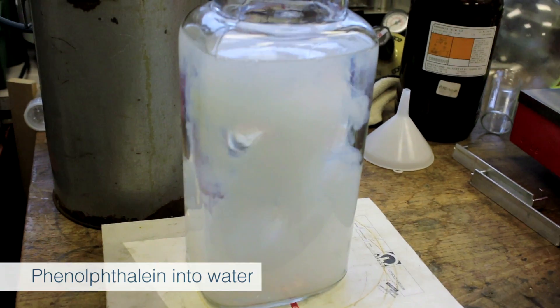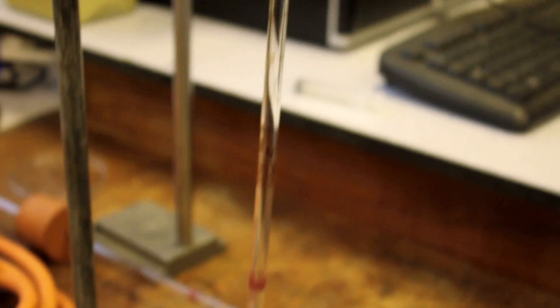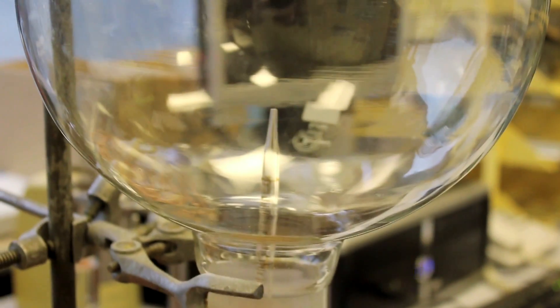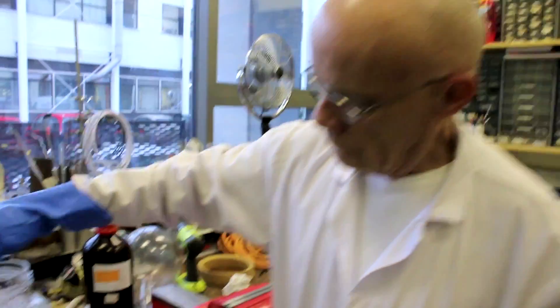The classic experiment is called the ammonia fountain. It consists of a large glass bulb filled with ammonia, which has a cork or bung in the bottom with a glass tube going through it about halfway up the flask. The idea is that if you put the bottom of the tube into water, the ammonia starts dissolving in the water.